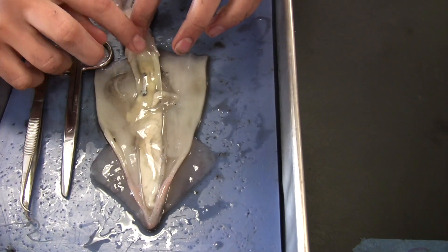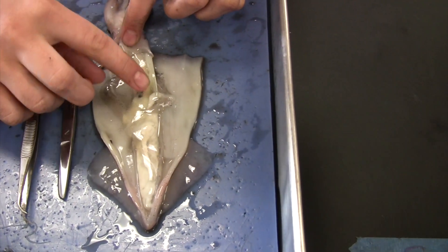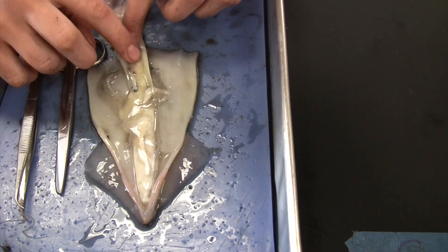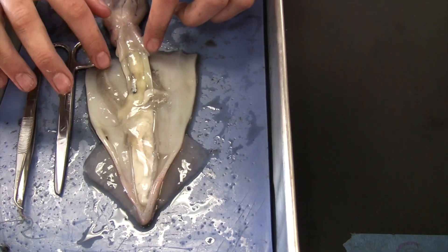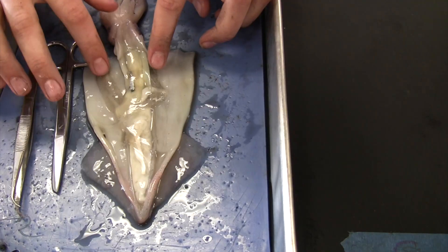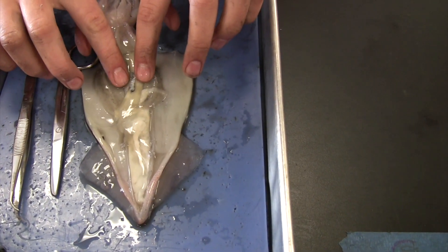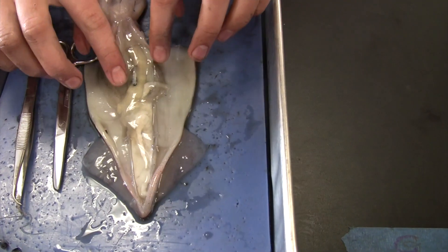So this is all the organs. This is the liver — the yellow-white thing in the middle. And then these are the gills; they look like black, wet feathers. And then the silver thing right here is the ink sac, in the middle by the liver.